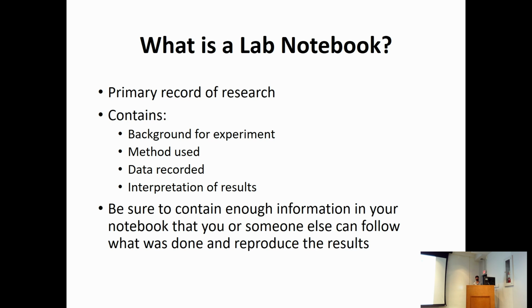If your peers, your PI, or someone else asks how you got this result, can you prove it the way that you did? You should have enough information in your lab notebook to show it. If someone else wants to follow or reproduce the results, you should have enough information there to guide them throughout the process. That's the major purpose of a lab notebook.